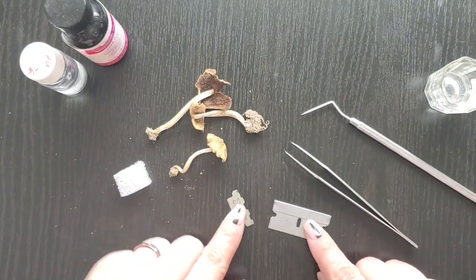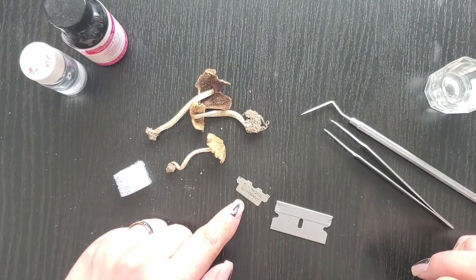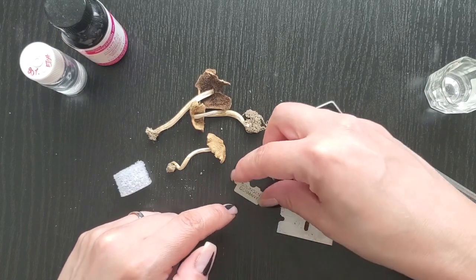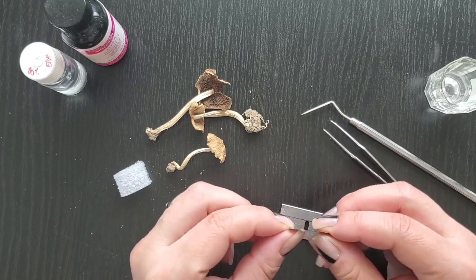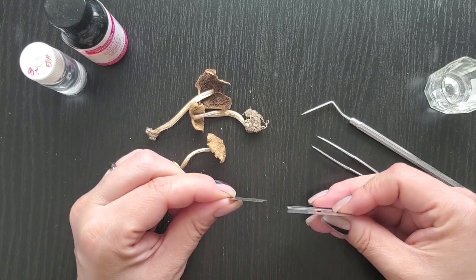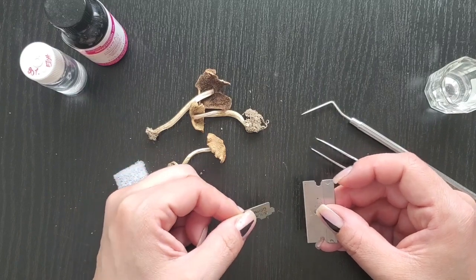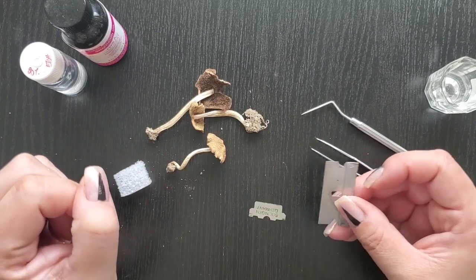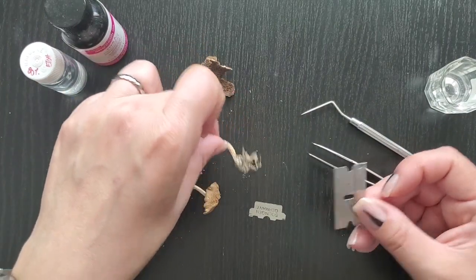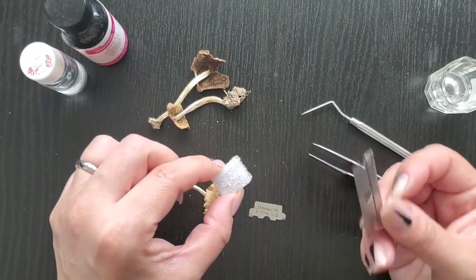And if you have the option of choosing what kind of blades you can use, I recommend using these really thin ones. This one's been cut in half to save the whole thing, but these are the best if you can find them because they're much more flexible, and they're much thinner than, say, these guys. So this is good for heavier duty things, for cutting into the fruiting body, especially when they're large, or when you're trying to cut through the base of a fruiting body that has a lot of dirt or rocks still attached. This is good. If you're trying to cut your Styrofoam to give it a shape, this is also okay.